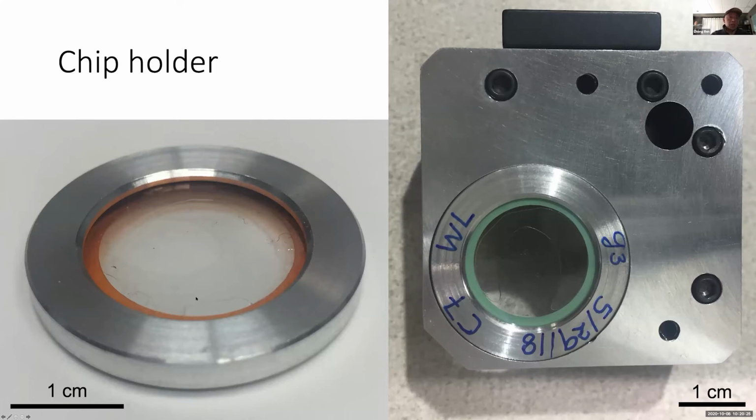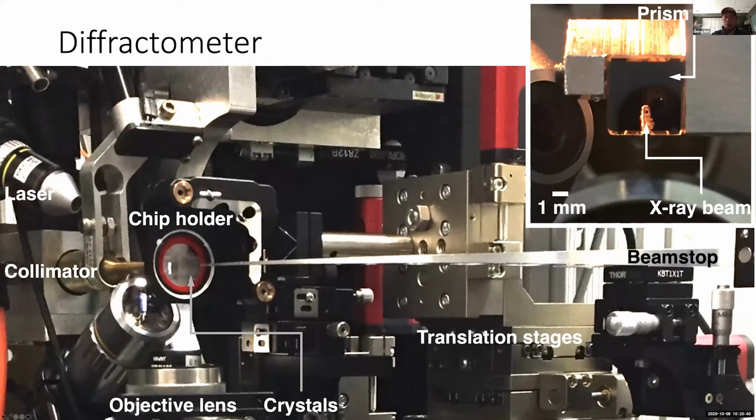So again, this is a chip holder. This is a different design from the current version of the chip holder, and then we put this whole device on this kind of carrier, and we mount this chip holder here on a two-dimensional, two-axis translation stage. And then the X-ray comes from the collimator behind this window. And then this is the beam stop. And then underneath, this is the objective lens looking upwards through a 45-degree mirror.